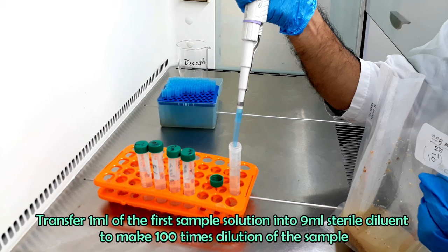Mix the first dilution by shaking. Transfer 1 ml from the first dilution or 10 inverse 1 dilution into trial 1 plate. Transfer another ml from 10 inverse 1 dilution into trial 2 plate.